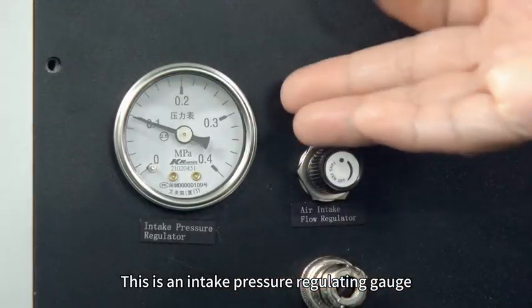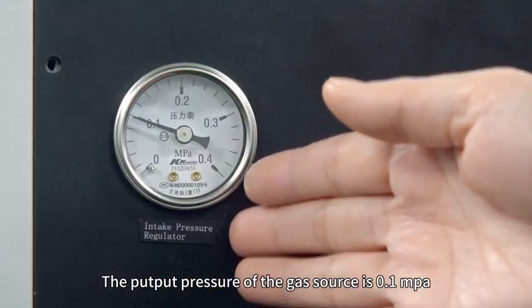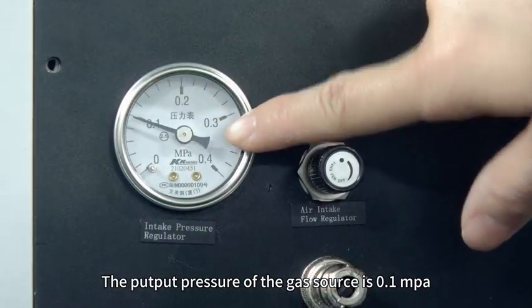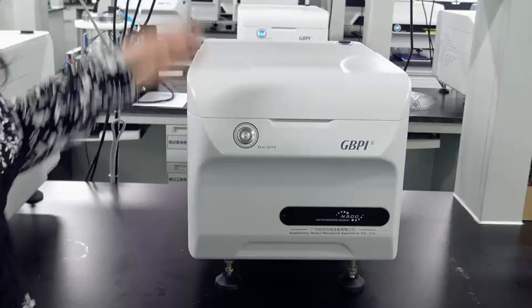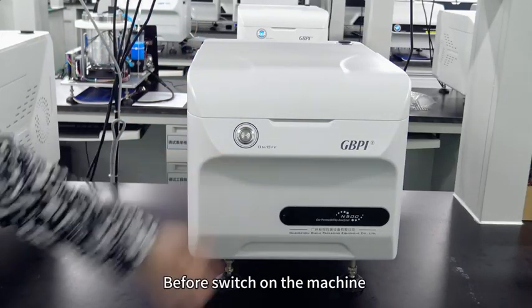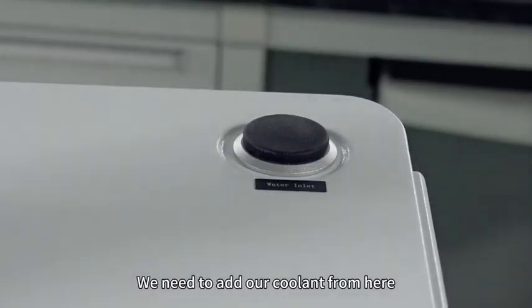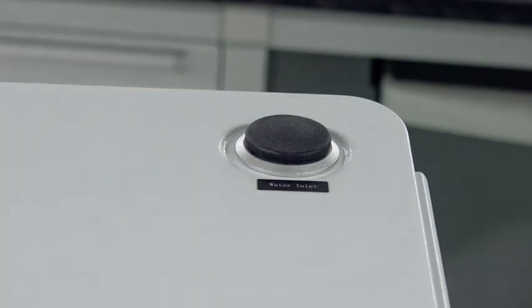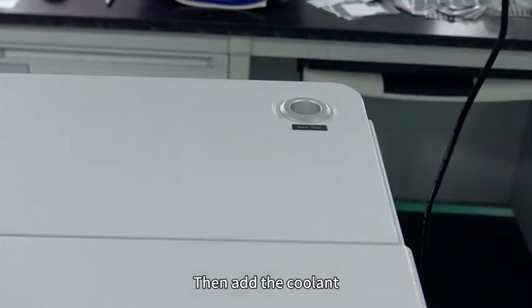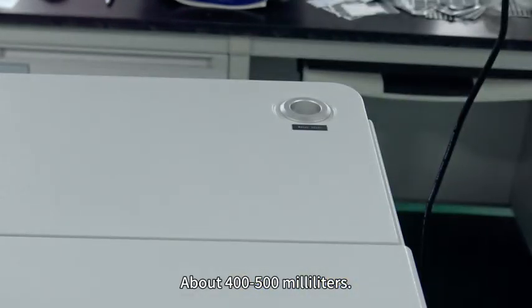This is the intake pressure regulating gauge. The working pressure of the gas source is 0.1 MPa. Before switching on the machine, we need to add coolant from here — remove the black rubber plug and add the coolant, about 400 to 500 milliliters.